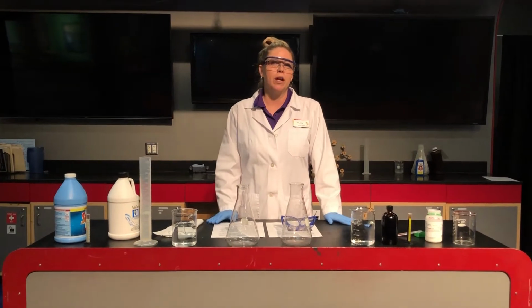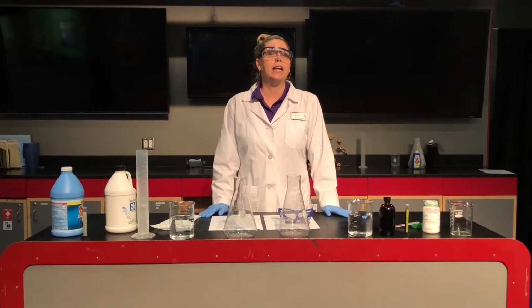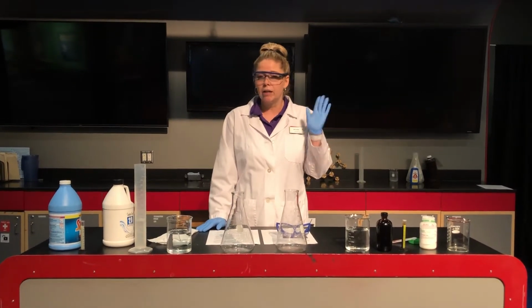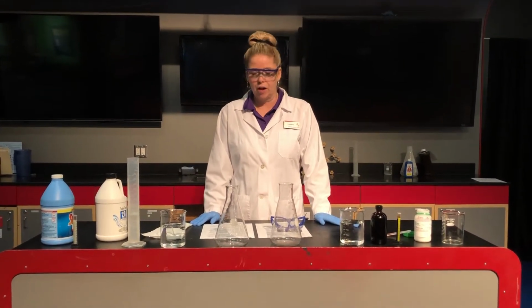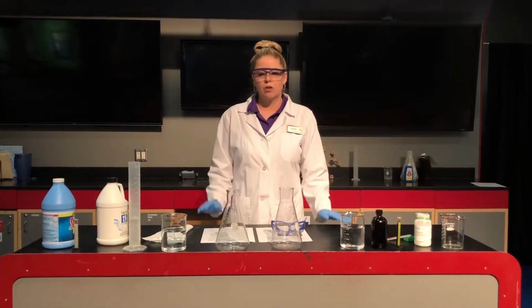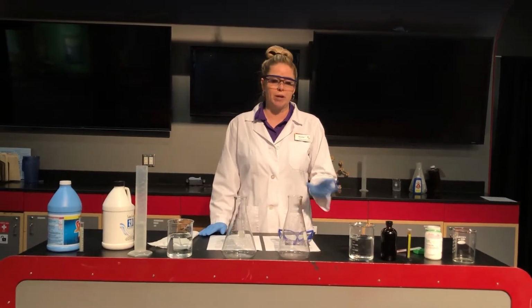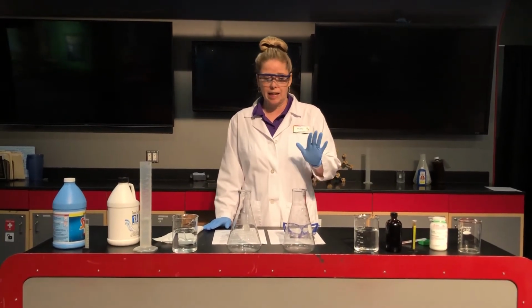We want to use our nose. Sometimes we might smell that there's been a reaction. We could hear bubbling or some other noise coming from our reaction. We could feel a change in temperature. So all of those senses we're using for our chemical reaction to see if a reaction has occurred, but we're not gonna taste the chemistry today.